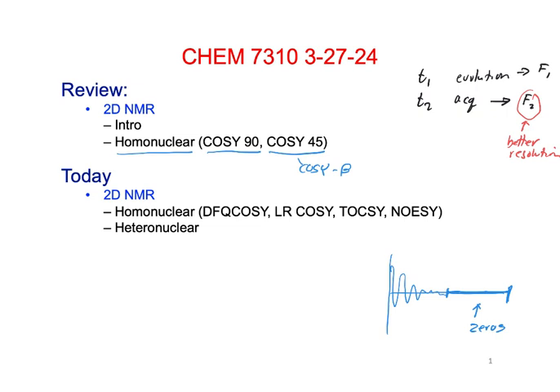And we could also get the sign of the coupling constant, which would allow us to identify geminal couplings versus vicinal.